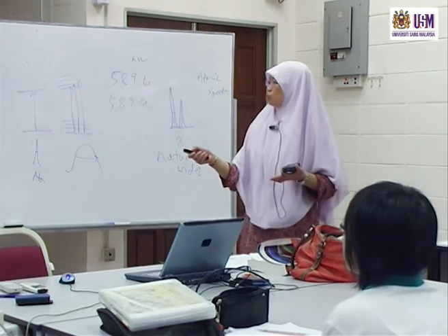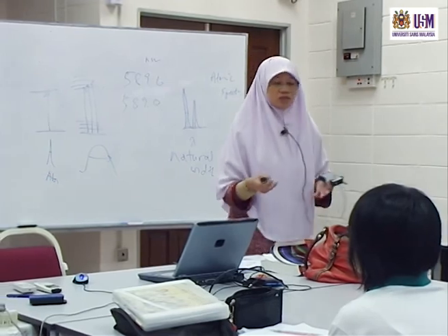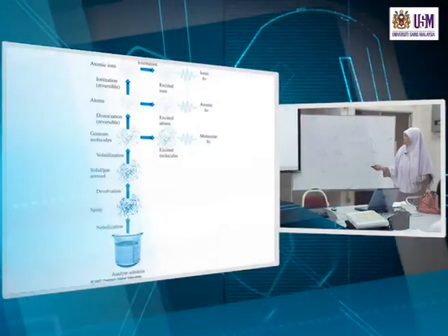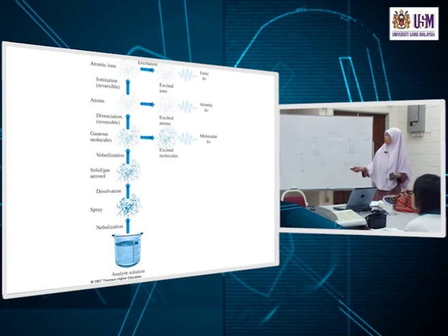So you will have all these kinds of species. I mean, ideally not everything becomes atoms, no. You have atoms, molecules, ions, a mixture in your flame. Showing what the processes involve in atomic absorption. Okay, you have your analyte sample, your solution, undergoing nebulization through your nebulizer, becoming fine droplets, which are not all of the same size. Through any nebulization process, we are going to get droplets of various sizes, some small, some big. Okay, you have a distribution of particle sizes.